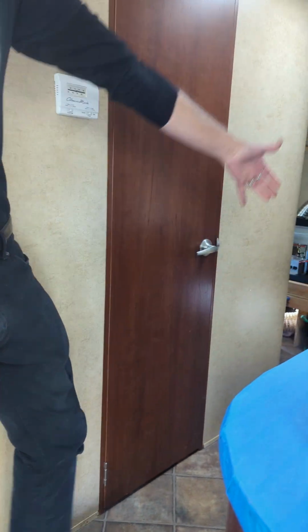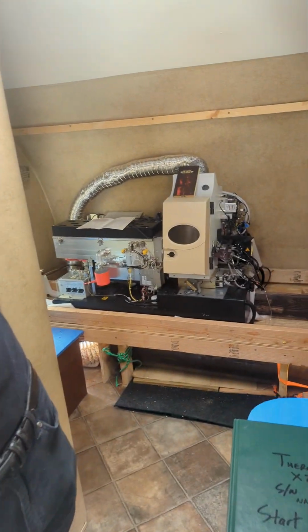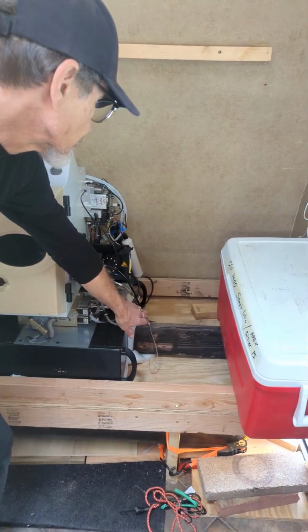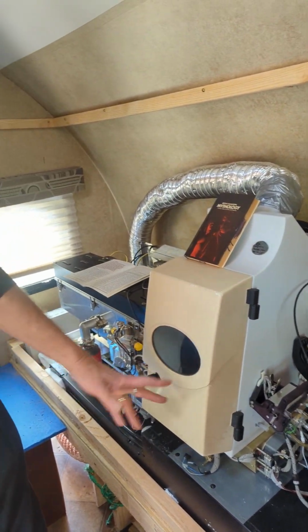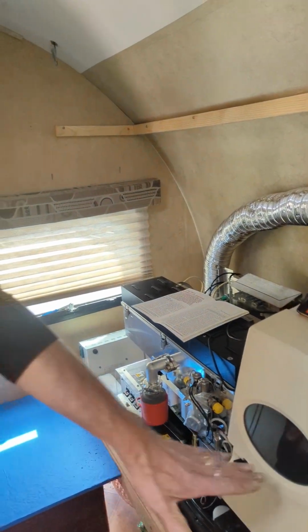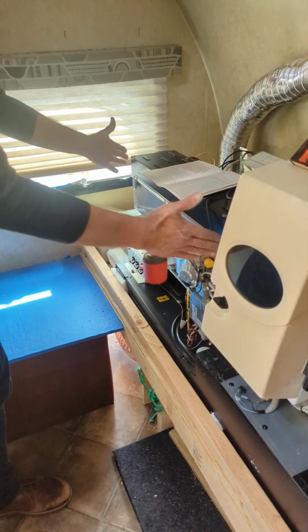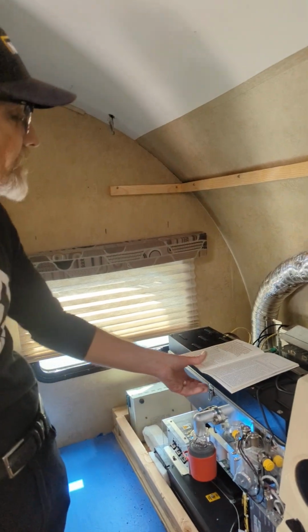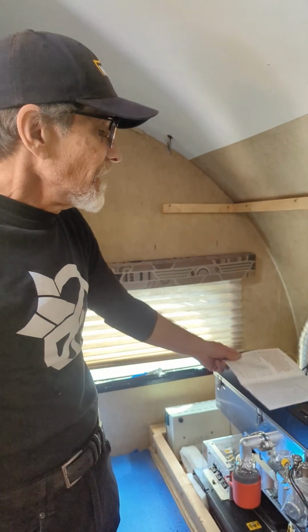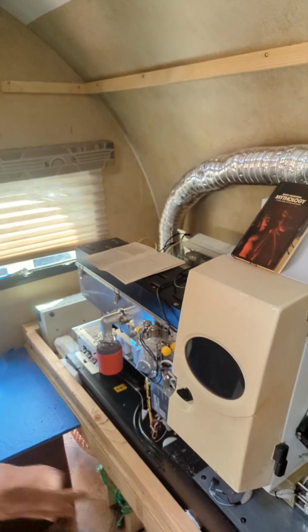And here, up in the front part of the trailer, is the showpiece instrument. It's the mass spectrometer. You introduce liquid samples. They're pumped into an aerosol-making device called a nebulizer, and then you vaporize all of those liquid droplets and put it in a plasma, argon gas plasma, and then that's extracted and goes into a mass spectrometer, which basically separates those vaporized atoms according to mass. I'm glossing over a lot of this, but it's well-known technology, and here's actually my paper from a while ago on this topic. But that's the mass spectrometer, and we've installed it into this trailer.